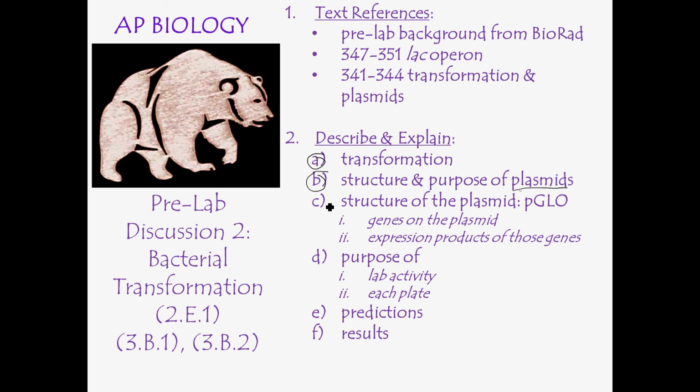And then being able to describe and explain the structure of the plasmid, specifically the one we're using, which is called pGlo. On that plasmid there are genes, so be able to identify what those genes are, and also be able to describe and explain the expression products of those genes.